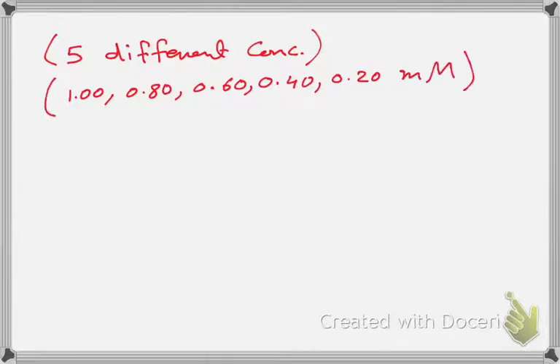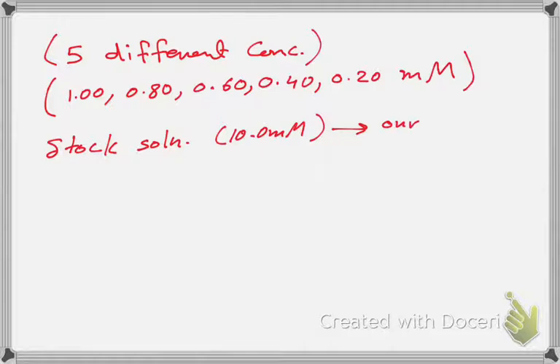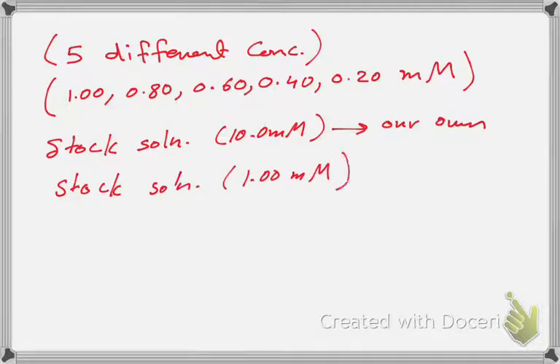And we learned how to do this in the lab. We started from our stock solution in the lab, which had a concentration of 10 millimolar. Then we made our own stock solution that had a concentration of 1 millimolar. That allowed us to plot all our numbers in Excel and create the following.